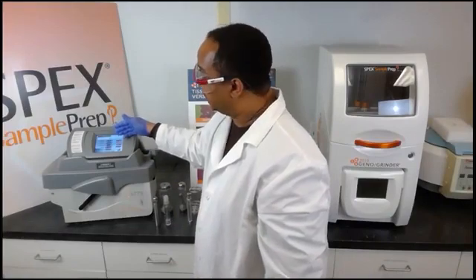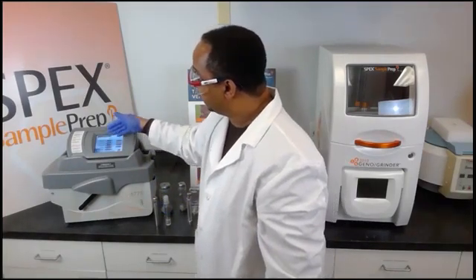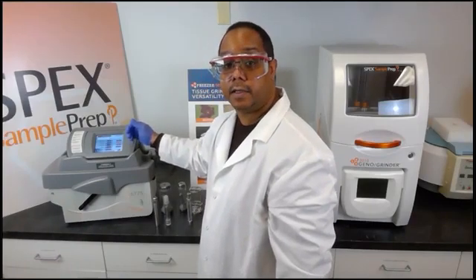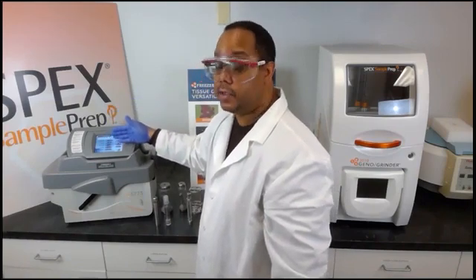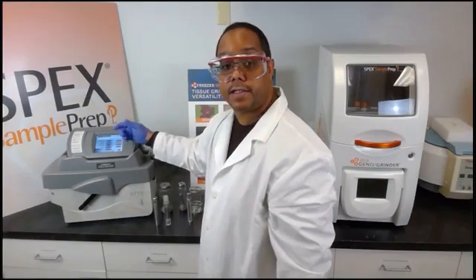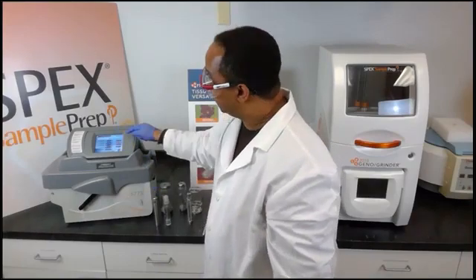From this point on, we can set the program through a touchscreen, which allows the user to set the pre-cool, which is a time designated to chill the sample down to cryogenic temperatures. Then we can program the runtime, which enables the impactor to move back and forth to crush the sample, the number of cycles to include multiple run times, a cool time, which is a time in between the cycles where the impactor is motionless, and the rate, which controls the speed of the impactor. Protocols can be stored or recalled. After the program is set, we simply press run.